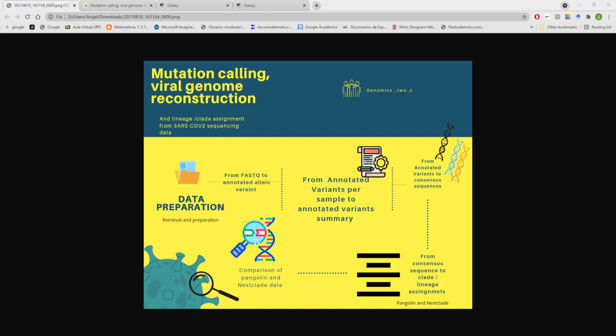3 workflows have also been used, corresponding to the different steps carried out on the Galaxy platform EU server, and 2 more tools for the final analysis. To start, we will create a new history in Galaxy, rename it, and upload the files needed to perform the analysis: samples dataset and auxiliary datasets.